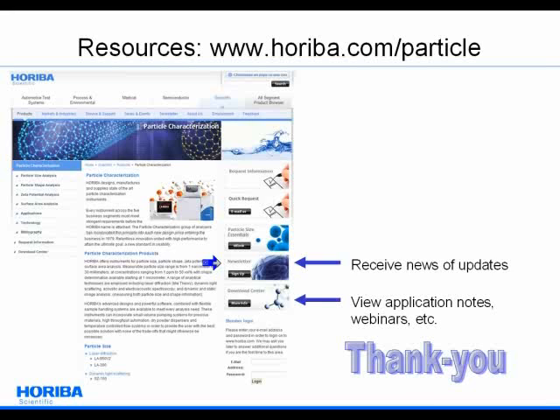So that is the majority of what you see published, and so that is what a lot of people use. Now, if I install a dynamic light scattering instrument, which I do, all the systems we sell in Europe, I usually go install them, then I'm looking at customers and I say, well, you get the Z average, but then we actually use a separate algorithm to calculate the mean. If you have more than one peak, then I usually say you probably want to switch to using one of the mean values, because the Z average doesn't give you any information about bimodal or multiple modes in your distribution. So what I usually say when I install instruments is use that Z average if it's a single mode. If it's bimodal, you're almost forced to switch to one of the mean diameters because that picks up on the modes of different peaks.